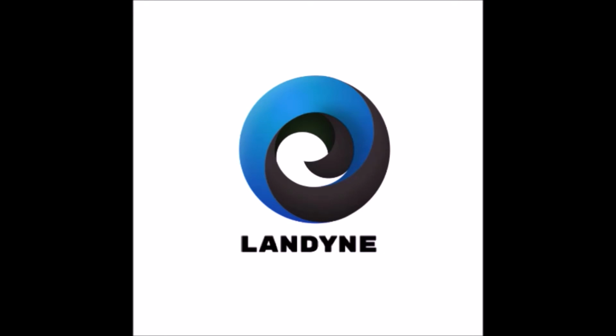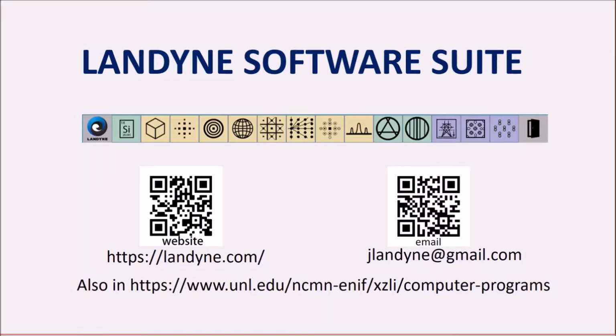The purpose of this video is to introduce the software HOLZ, a computer program for simulation of high-order Laue zone patterns. This is one of the components in the Landyne suite for electron diffraction simulation and crystallography analysis. You may download the software suite on the Landyne website.